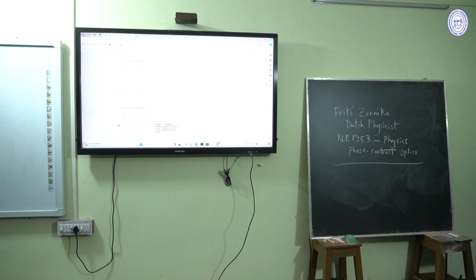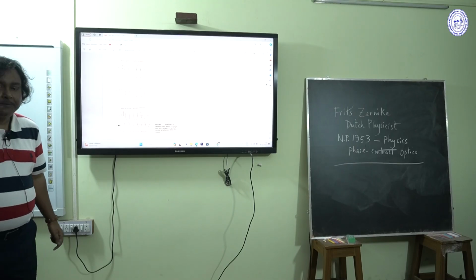We are able to see the object with the help of light. Light of the same wavelength can have different brightness, and this brightness or dullness can be perceived by our naked eyes, and this is due to the difference in amplitude.